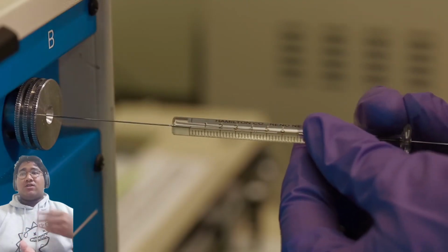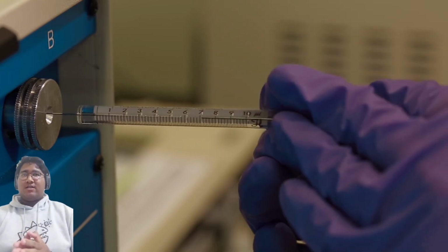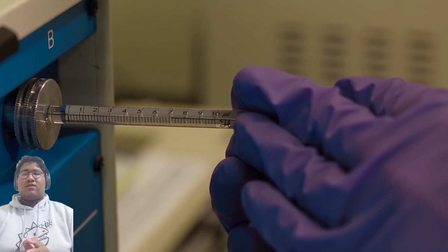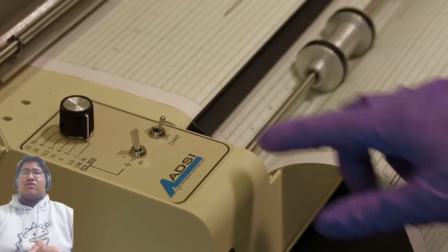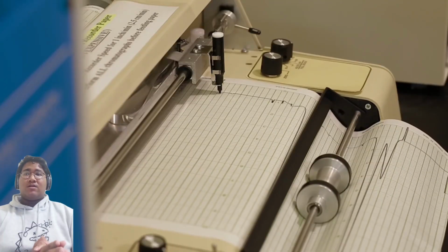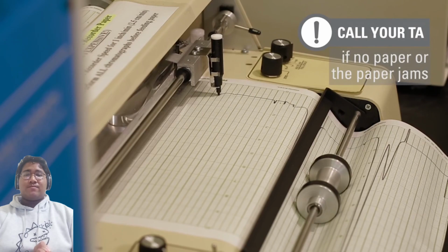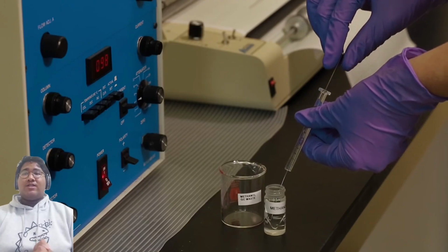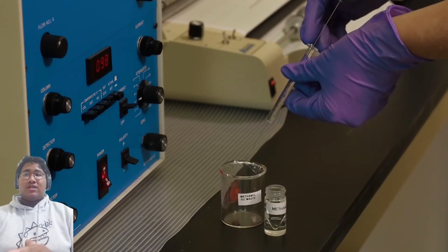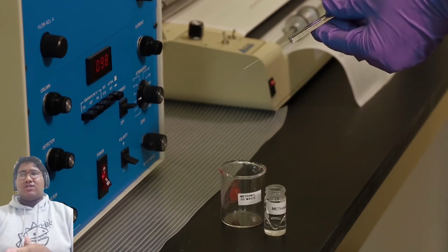Insert the syringe into the GC injection port. Remember not to bend the syringe in or out. Then turn on the chart recorder. Make sure it is recording and wait until the entire sample runs through the column. For now, wait for the result and don't forget to clean your syringe with a solvent such as methanol. That's it for methodology. Thank you very much.